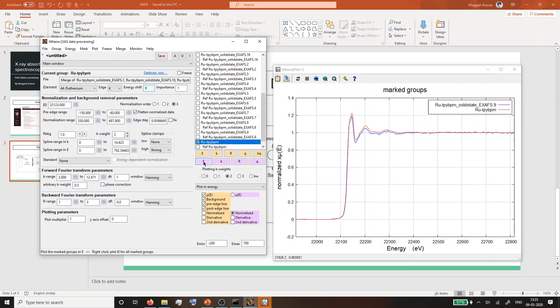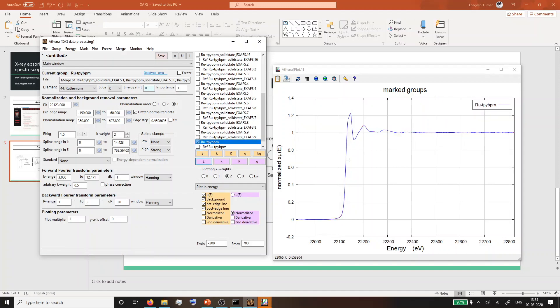And now this merged data can be used further.